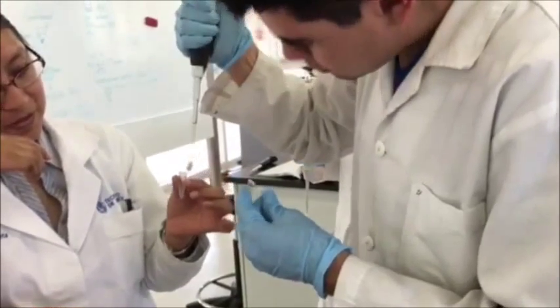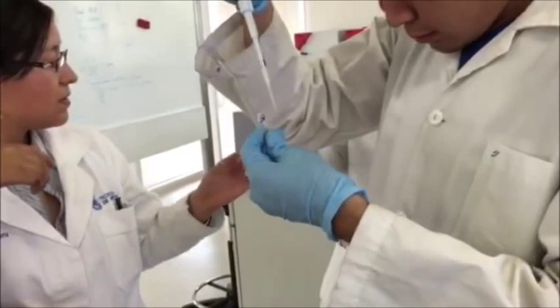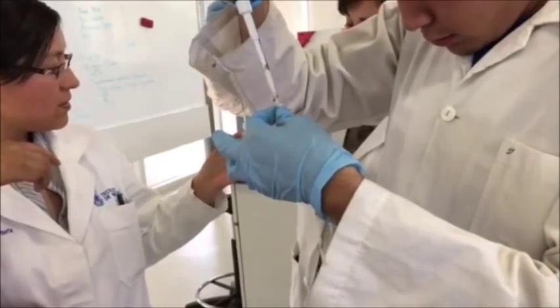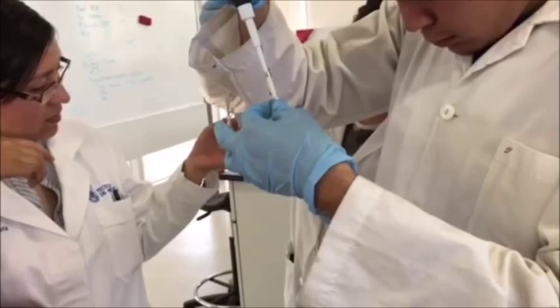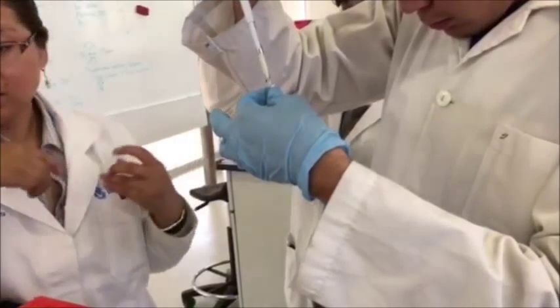The next day, you take a picture of the plate and keep it in the fridge. These colonies will be used in the next practice for the extraction of plasmid. For that, it is recommended to grow 2 colonies, one white and one blue, of the ones that grew in the LB plate with X-gal and ampicillin.